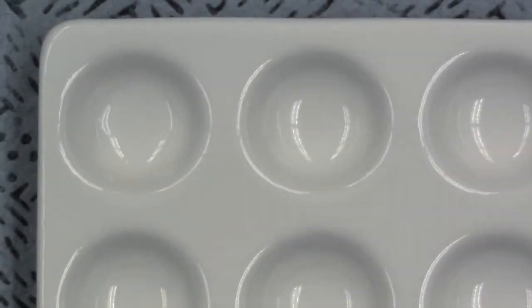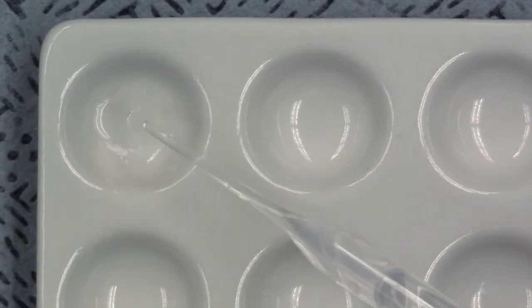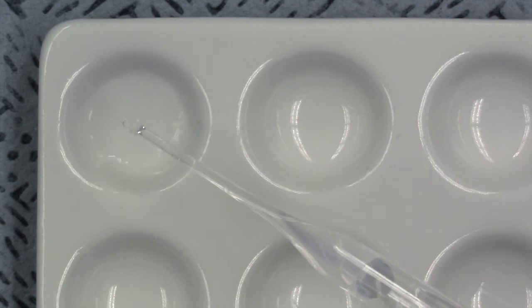Okay, class, now that we've taken our samples of starch and treated it with acid and treated it with water and then heated it for 5 or 10 minutes, we're going to try to see what the result of our experiment is. In well number 1, this well right here, we're going to put our starch and water solution. So let's just put 5 drops in there. 1, 2, 3, 4, 5.